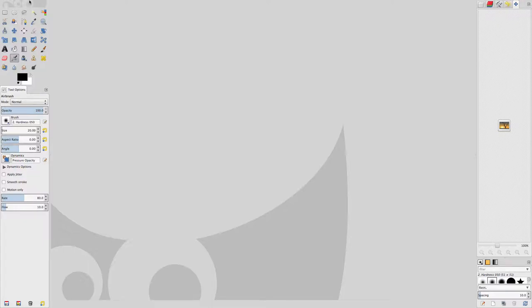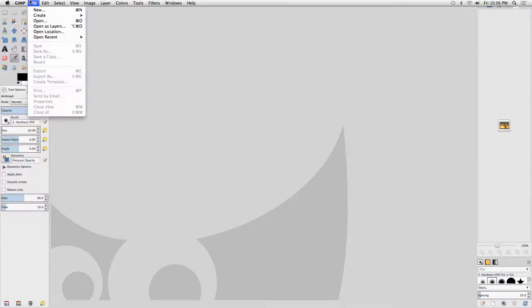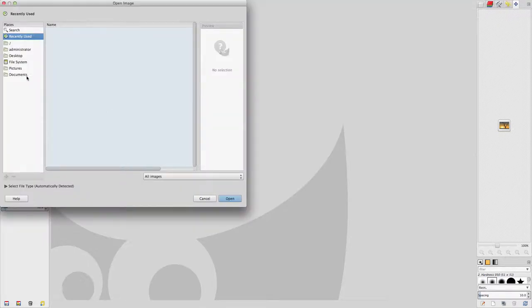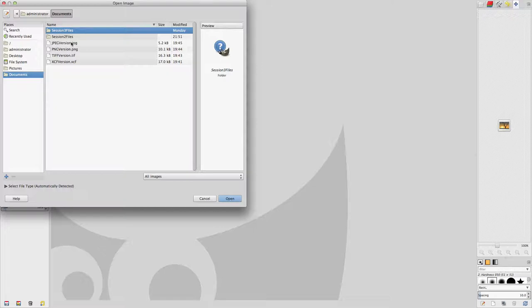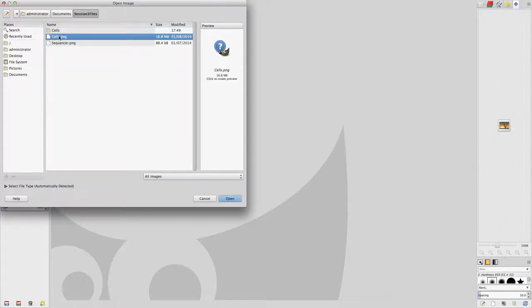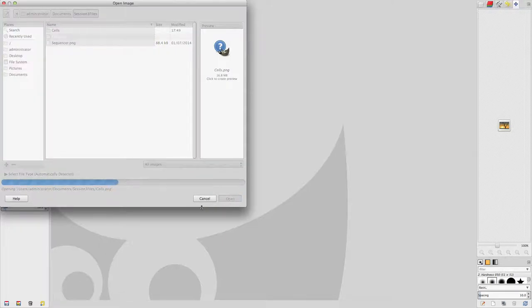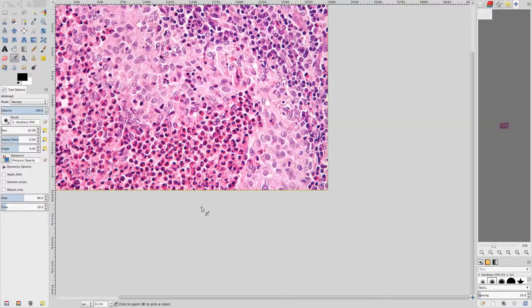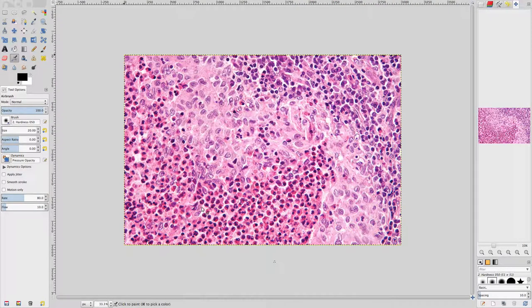Go to the File menu, select Open, then go to the Copy of the Session 3 Files folder and open Cells.png. An 8-bit per channel RGB bitmap image of cells appears in the main GIMP workspace.